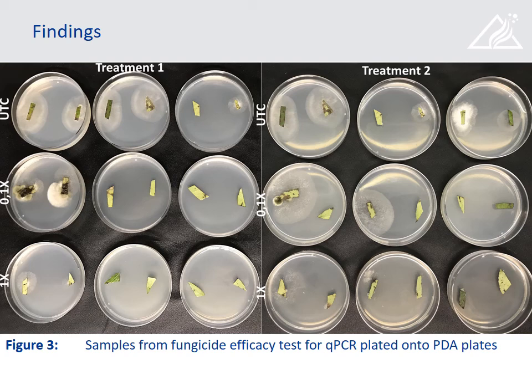We've already done it, and we can see a gradient effect here. Although you see fungal growth here, it's not necessarily from botrytis. It can be from any endophyte or fungi that were not killed by the treatments we used.